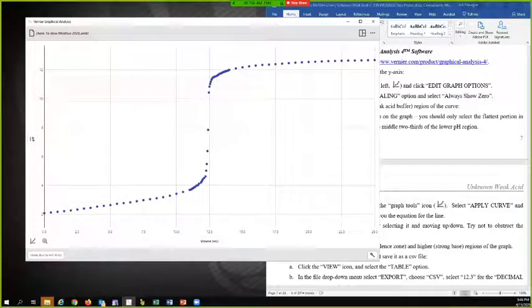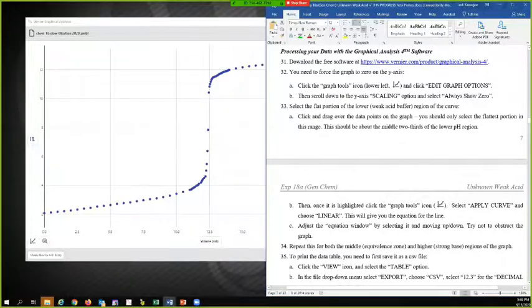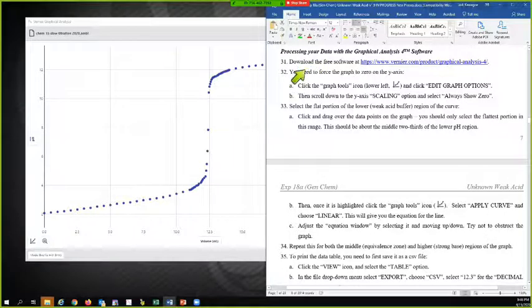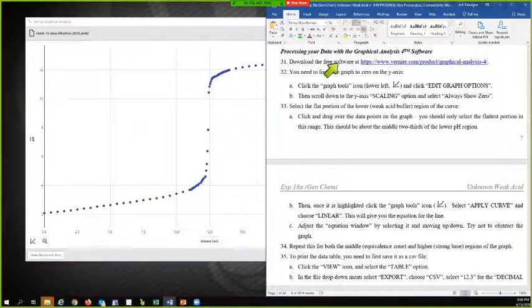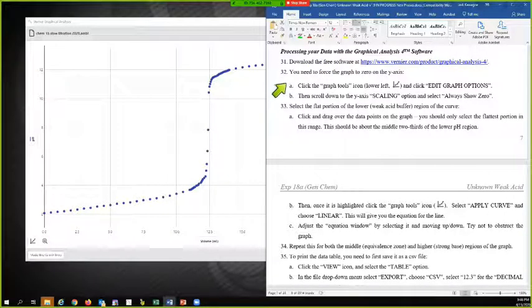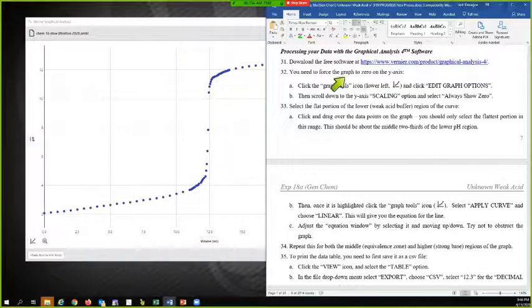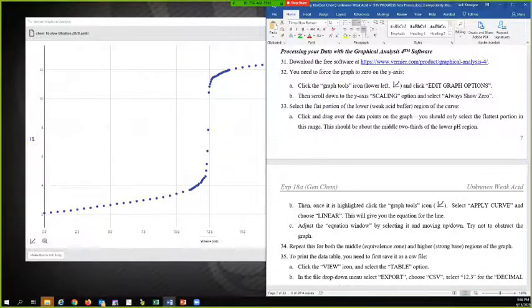So I am on this part of the experiment: processing your data. You download the free software. I'm going to have to force the graph to zero on the y-axis.